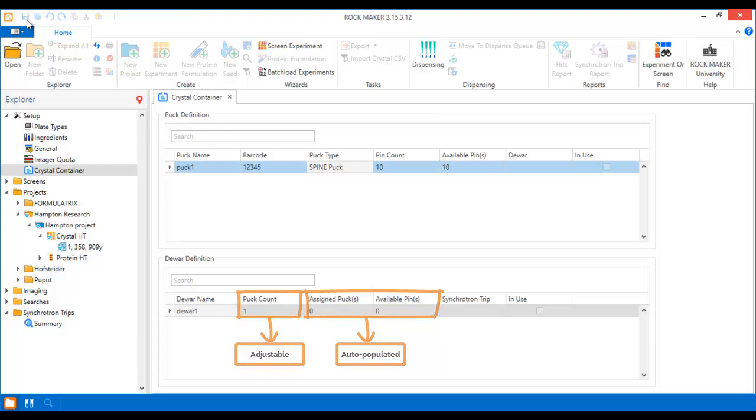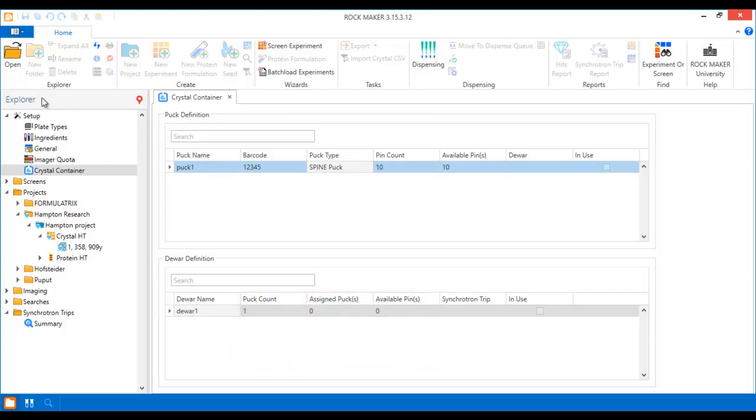If you already have the beam time for an upcoming synchrotron trip, you can define it in RockMaker now. Don't worry, you can save this step for later if you don't have any trips planned just yet.